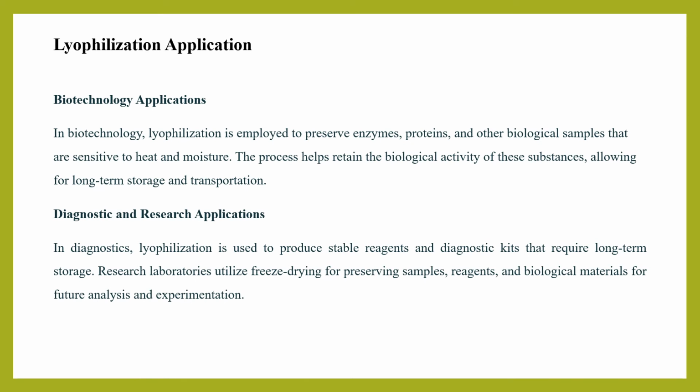In biotechnology, lyophilization is employed to preserve enzymes, proteins, and other biological samples that are sensitive to heat and moisture. In diagnostics and research, lyophilization is used to produce stable reagents and diagnostic kits which require long-term storage. Research laboratories utilize freeze drying for preserving samples, reagents, and other biological materials for future analysis and experimentation.